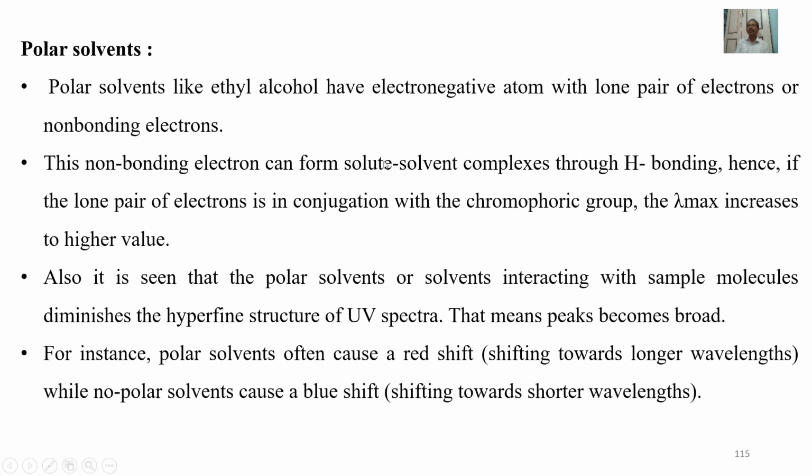Polar solvents. Polar solvents like ethyl alcohol have electronegative atom with lone pair of electrons or non-bonding electrons. This non-bonding electron can form solute-solvent complexes through hydrogen bonding. Hence, if the lone pair of electrons is in conjugation with the chromophore group, the lambda max increases to higher values.